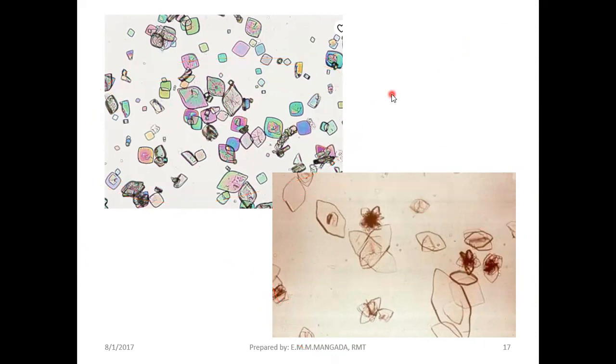We're not just using it for crystals in our urine, but we are also using it for crystals in our body fluids like synovial fluid, and other body fluids.